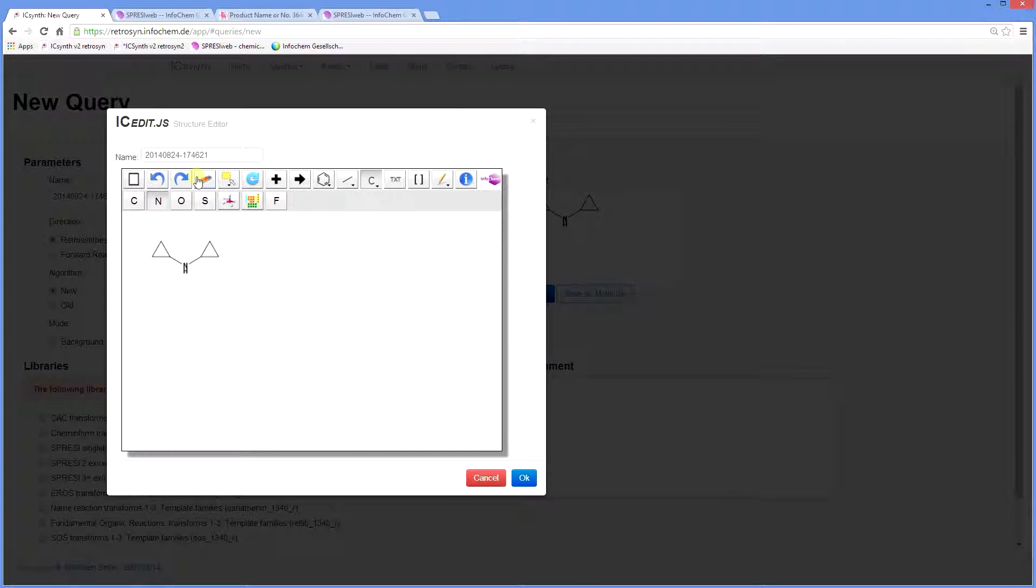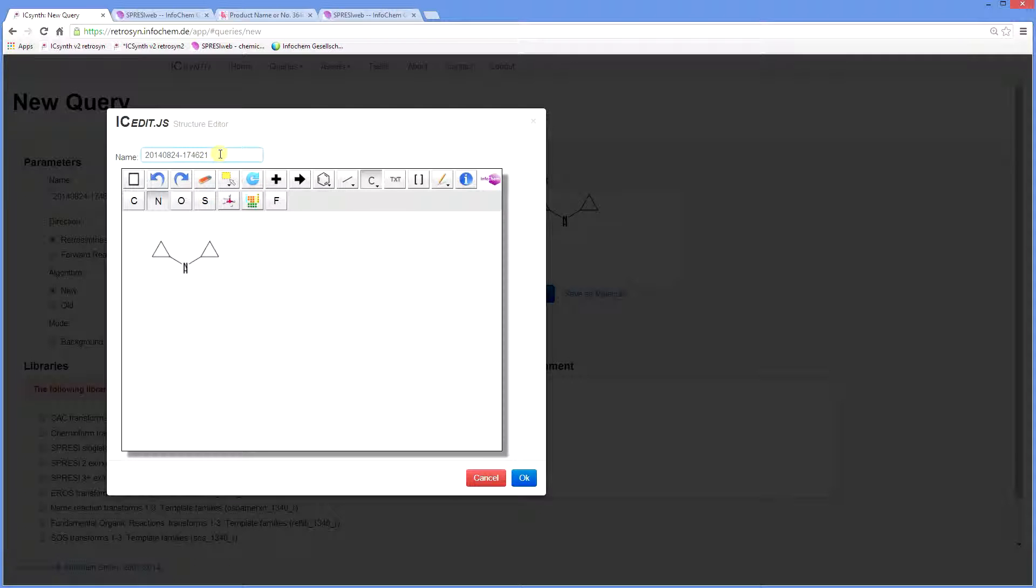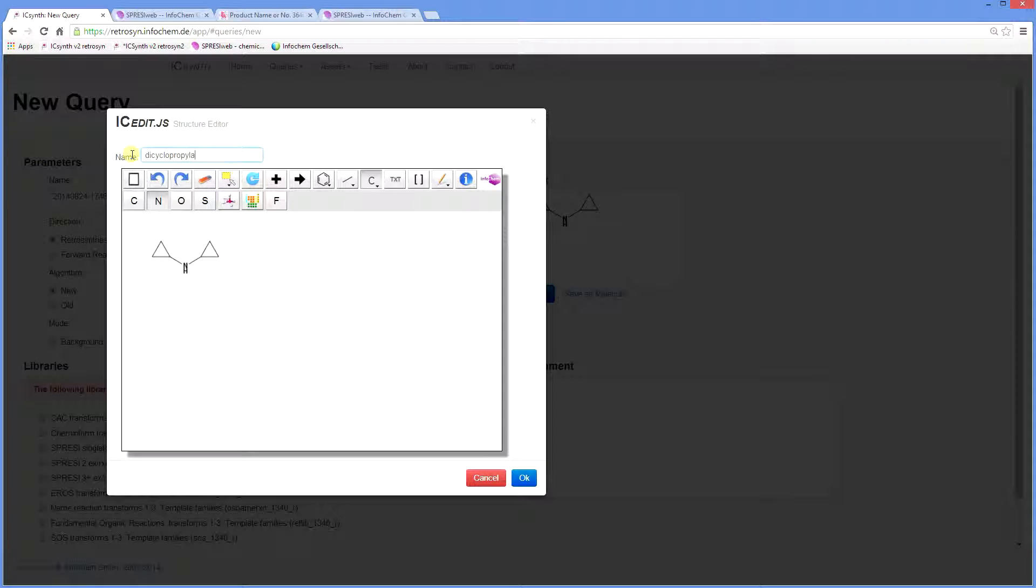Then click on OK when finished and the structure is transferred to the target window. You now have the option to give your new query a name. If you decide not to then the system will automatically allocate a query number, which is the date plus an additional check number. We will call this target molecule Dicyclopropylamine.